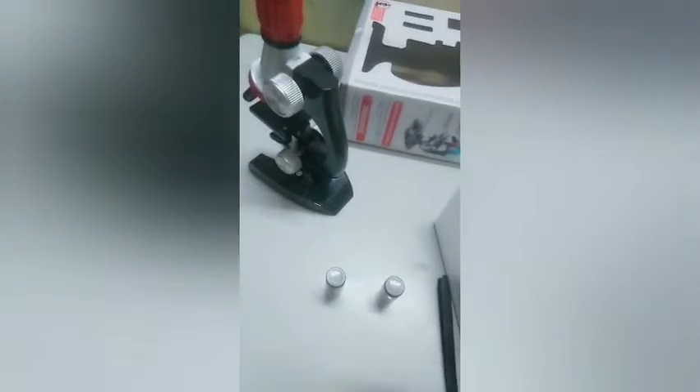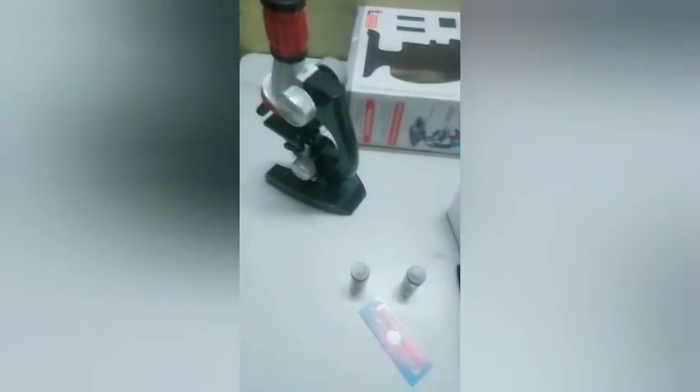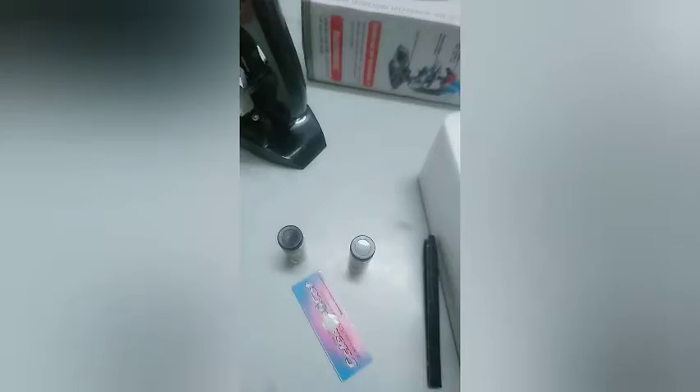Here we have got some bottles and we can collect something inside them. We also have one pre-prepared slide, but I don't know what's inside it. Let's check — there's something in there. We also got four slides. They are not made with glass, only made with plastic. And here is a small box.